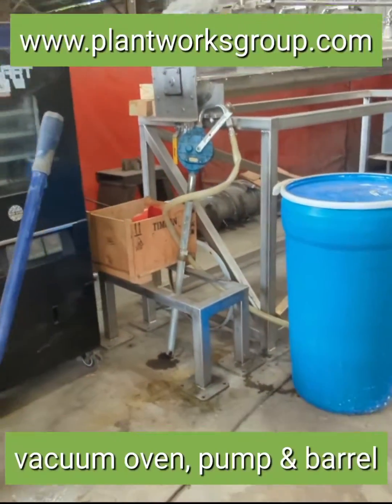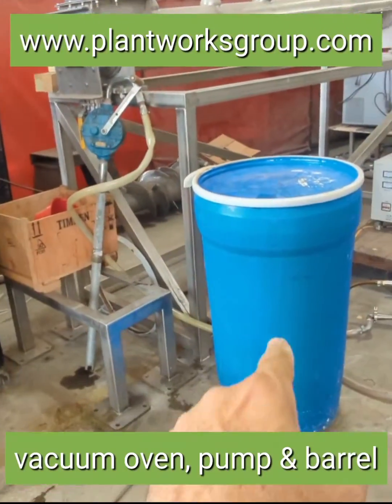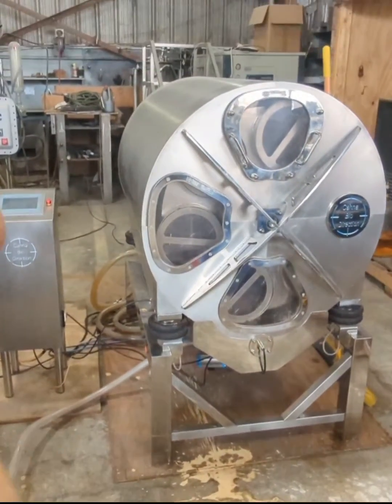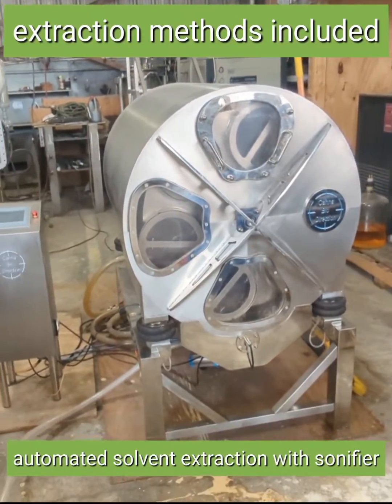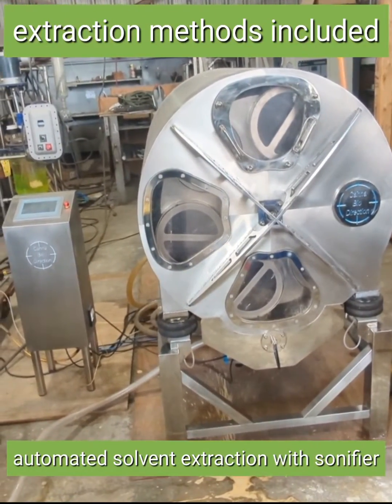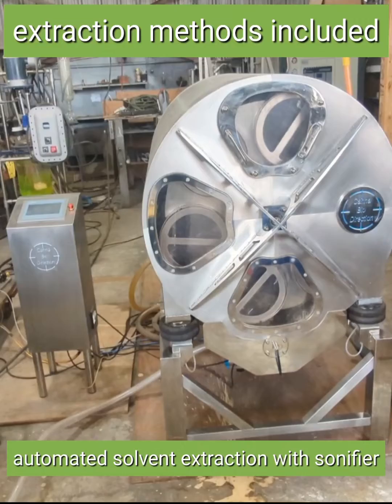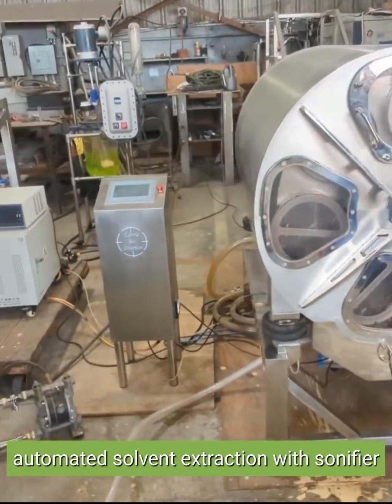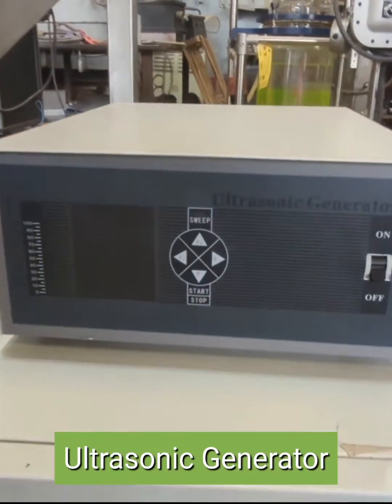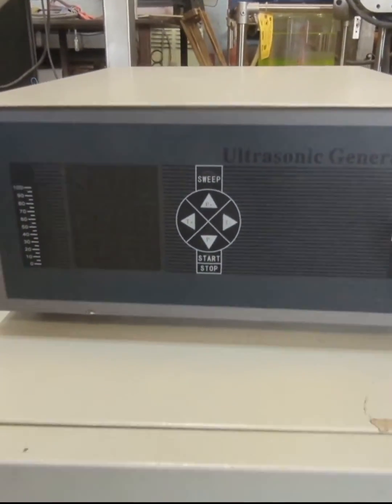You need a vacuum oven at the end. You need that hand pump, 55 gallon drum. This is the magic piece of equipment — a horizontal basket centrifuge that has built-in sonication and a couple other custom designs specifically for kratom. Here's the sonicator right here, an ultrasonic generator.